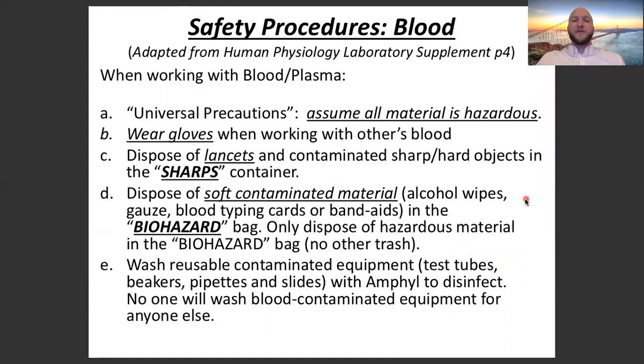All right, next up, this is our first time using blood samples in this class. Now, we're online, so we're not actually going to be doing this, but if we are in person, this would be the first time that we retrieve blood samples from each other. No, it wouldn't be. This would be the second time. I'm sorry about that. Yeah, so this should be old news. Use universal precautions when obtaining blood samples in lab. Assume every bit of blood is hazardous.